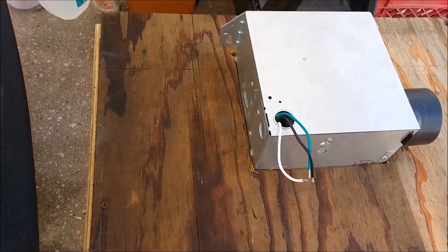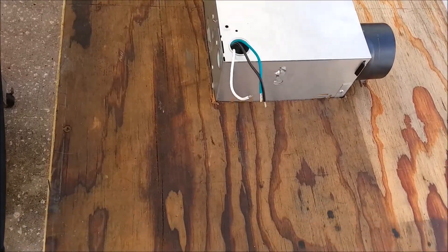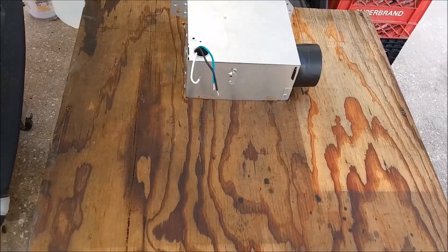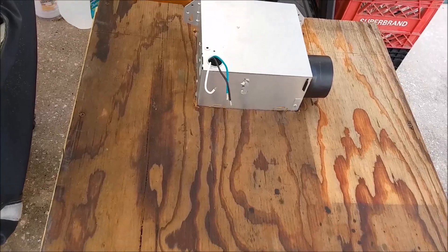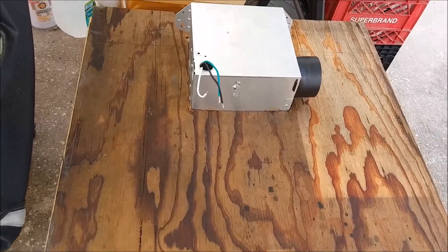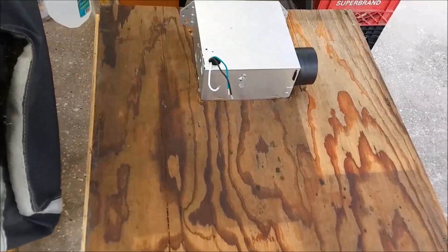I'll probably mount an outlet strip up here to plug the fan into, and I need to put some lights in it — it'll be dark inside. I'll probably put some LED strip lighting inside to light it up and have some outlets to plug things into like the blender and the hot plate. It's about two feet by two feet square, which I think is going to be big enough for most of what I do.